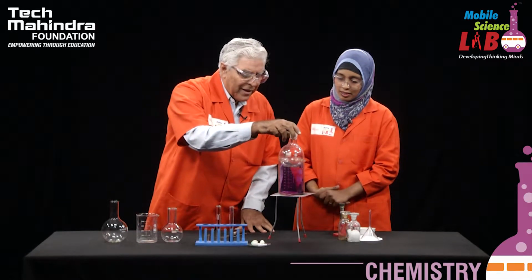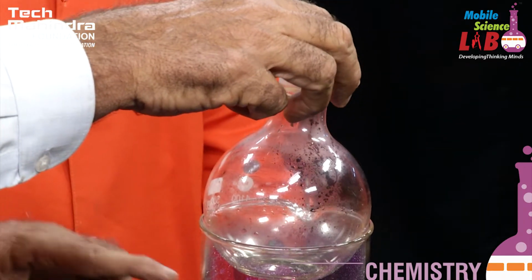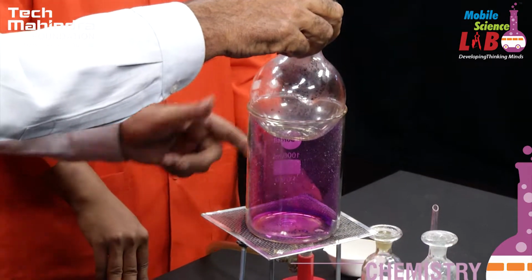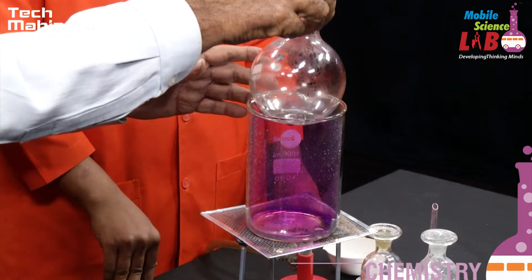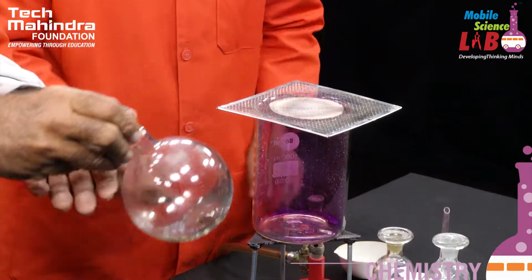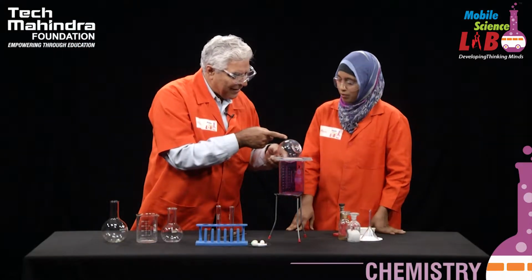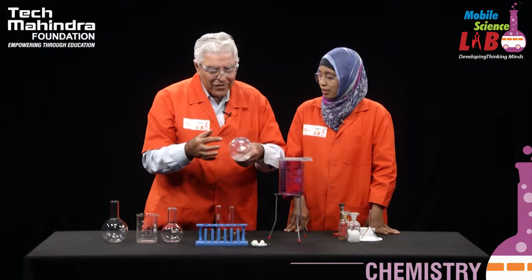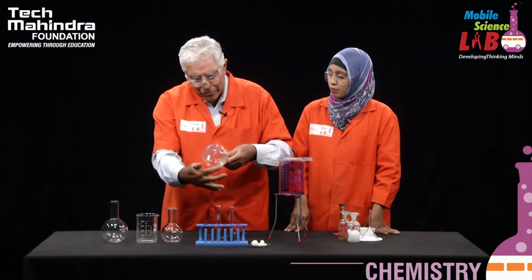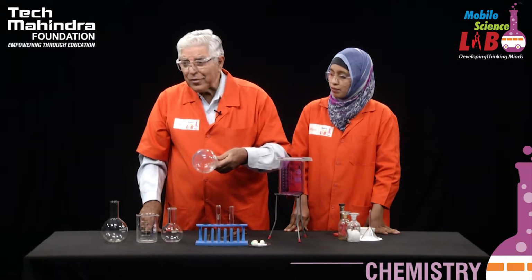Now we will try and see what happens over here. But I would like you to do one thing. When I take it out, cover it with this, so that a lot of gas does not escape. Fine, sir. Can you see this? Yes, sir. The beautiful crystals of iodine. Can you see, all of you can observe this? There are beautiful crystals collected over here. These are iodine crystals.